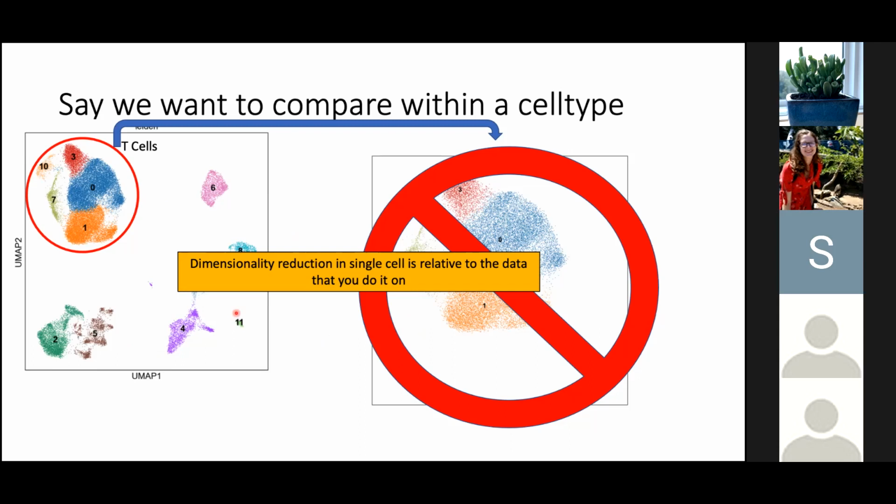It's an excellent question. It's funny, I actually read a Nature Methods paper that professed to answer this question. Their solution, Nature Methods, I remind you, was basically to cluster, build a machine learning classifier, and then reduce the number of clusters until that classifier can accurately classify each cluster. So in other words, we have no idea. I'm happy to share that paper, but long story short, we don't really know.